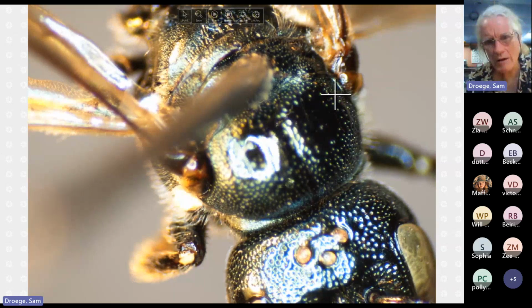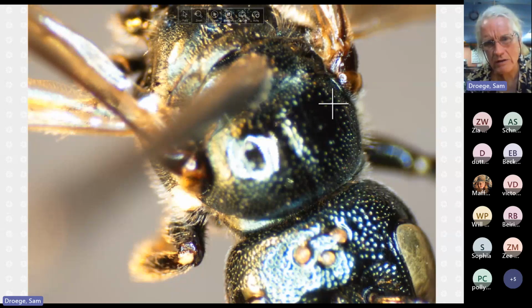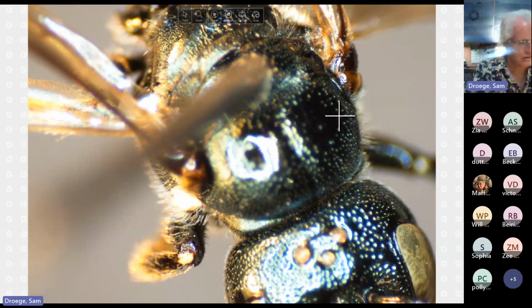There's the parapsidal line all the way over here. This is out of focus. There's a central line. Here's this big open field with essentially no pits, or maybe that's one right there. This is too glossy to see. And then you have a simple row, or one row. I'm not sure if I see that correctly.